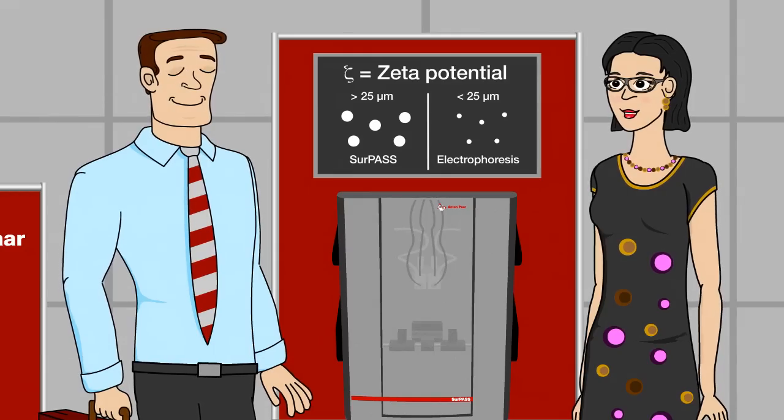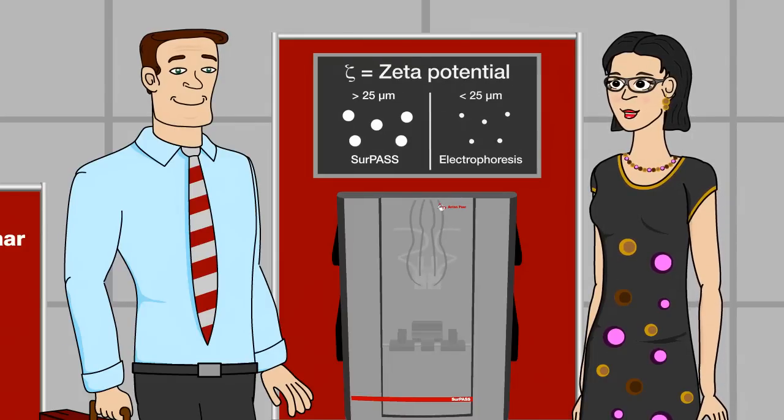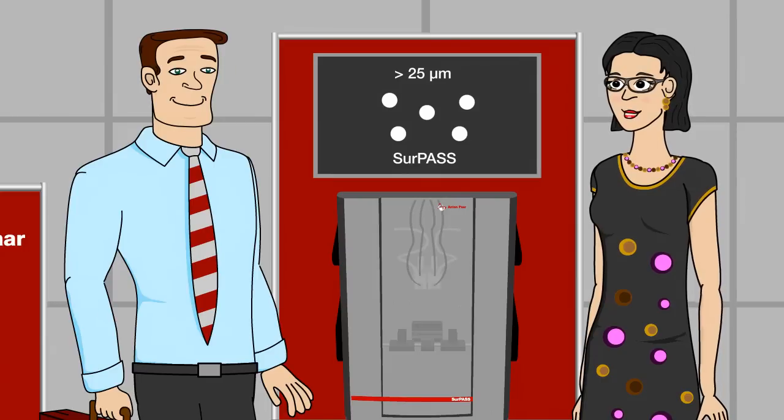This tells you how stable particle dispersions are, for example. The zeta potential is most famous in connection with such particles. So when people hear zeta potential, most of them will think about particles. That's not SURPASS. SURPASS analyzes the zeta potential of macroscopic solid surfaces.